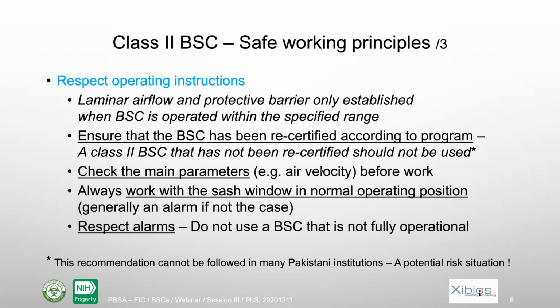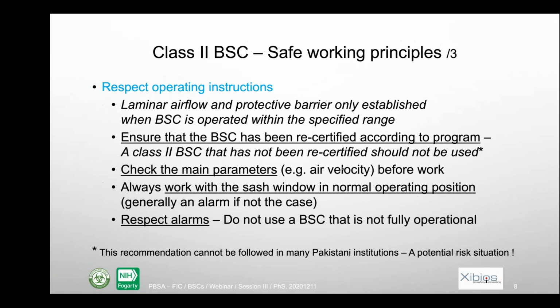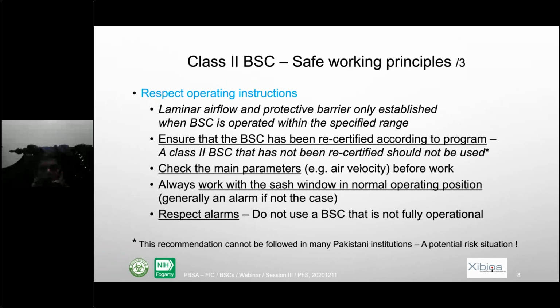Then when starting to work at the biosafety cabinet, you should check the main parameters, like the airflow velocity and so on. Most of the time you have some indication, and you also have a reading of the pressure before and after the HEPA filter and so on. You should check that it is in the specified range.